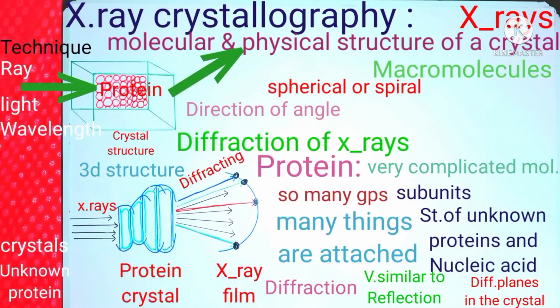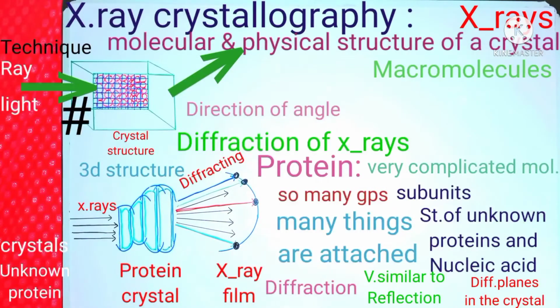Okay? So what we do is we take that crystal and we split it down into smaller unit fragments. Students, keep your attention on this important topic. What am I saying? Suppose we take this crystal, the whole protein, and break it down into smaller fragments that are imaginary fragments. We are not actually breaking the crystal physically, but only in imaginary fragments, imaginary units, or imaginary parts of the crystal, for understanding.